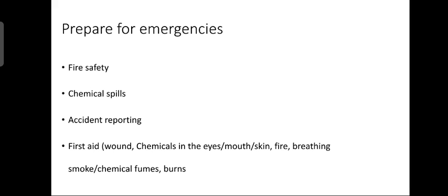If smoke or chemical fumes are present in the laboratory, all persons, even those who do not feel ill, should leave the laboratory immediately. Make certain that all doors to the laboratory are closed after the last person has left. Since smoke rises, stay low while evacuating a smoke-filled room. Thoroughly ventilate the room before going back to work.